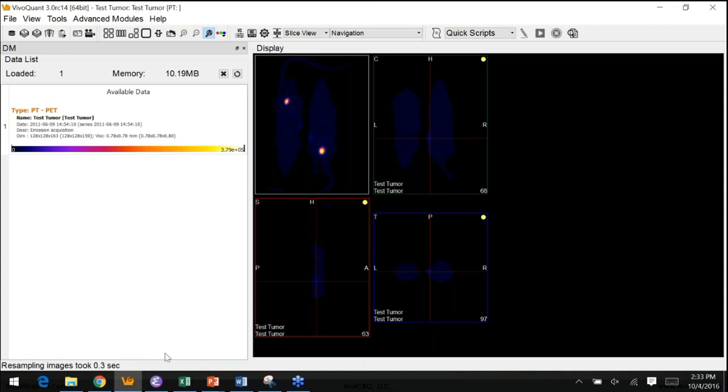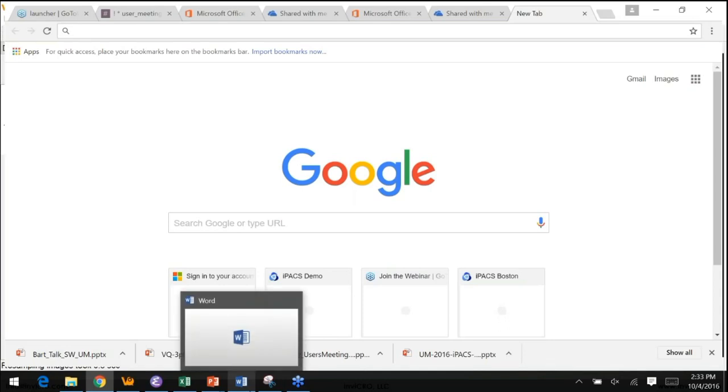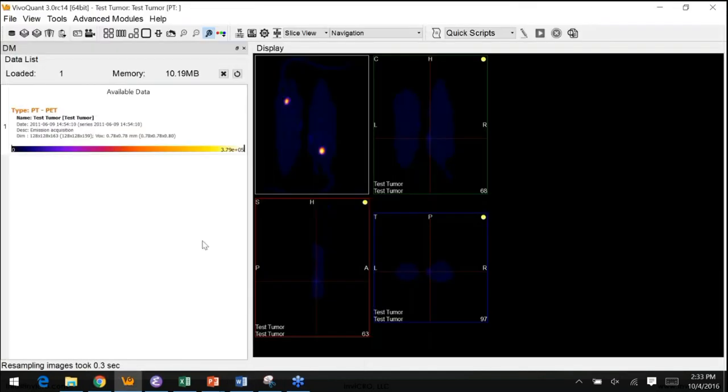So what I'm going to do in my script is actually load this session and just continue. So before I get too far ahead of myself, I'll open some useful resources here. Just open a new window, actually.